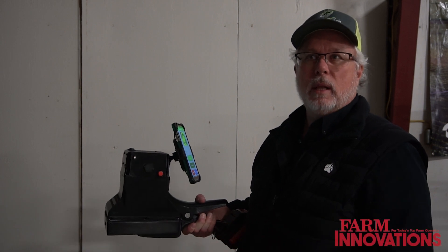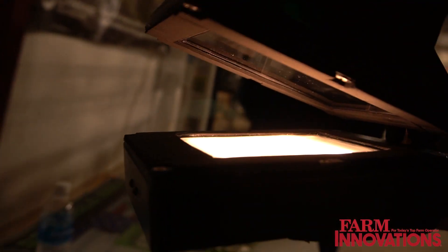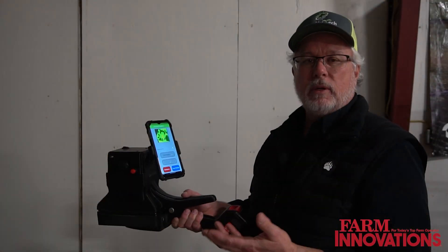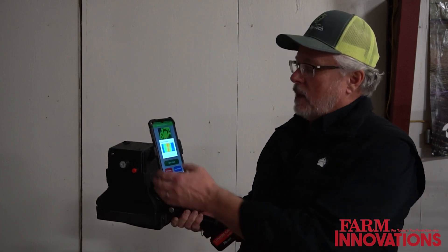I'm John Masco, founder and CEO of Leaftech Ag, and we bring to market a handheld digital lab that allows an agronomist or farmer to go to a field, stick a leaf in the scanner bed, scan the leaf, determine the nutrient content of that leaf, measuring 12 of the micro and macro nutrients in less than a few minutes.